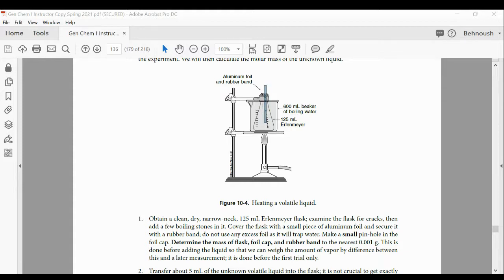Okay. After you clean the flask, you pour enough water to fill the flask completely, and you have to keep track of how much water it takes to fill up the flask. I expect everyone in class to answer the questions. I'm going to record how many questions are answered by each person. Just make sure that you do participate. And I know it's remote, but still these are important.